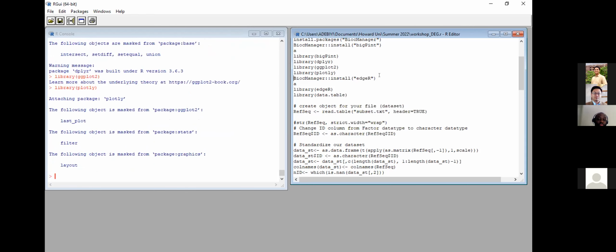Please make sure you do this stepwise so you don't miss a step. If any of these is not available, it means that you don't have the tool. It's like you're working on your car and the spanner is missing. You need to have all the tools available to finish this job. So if you don't library, you're just going to run into errors.